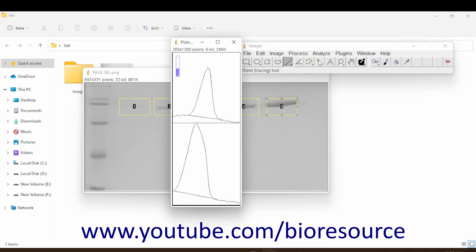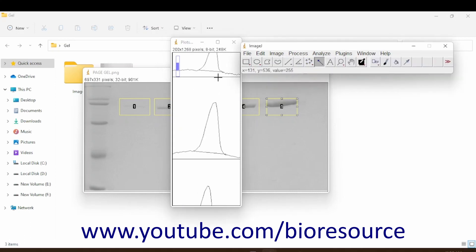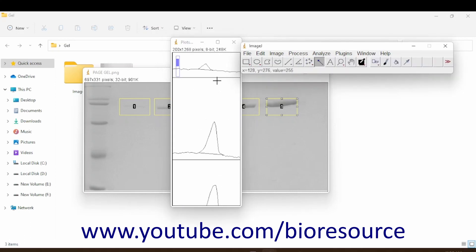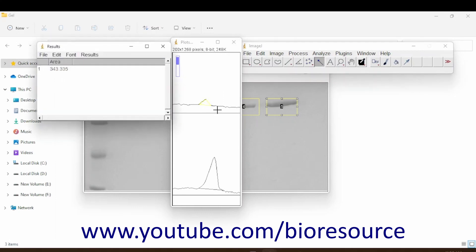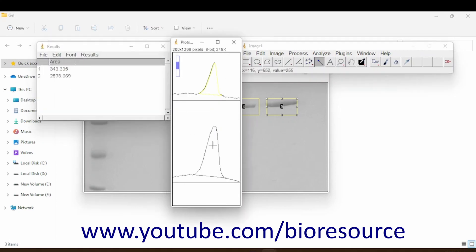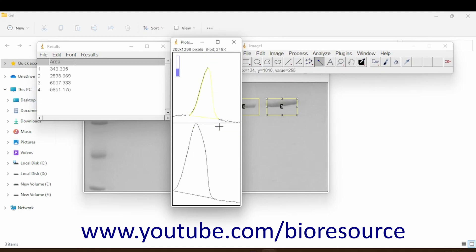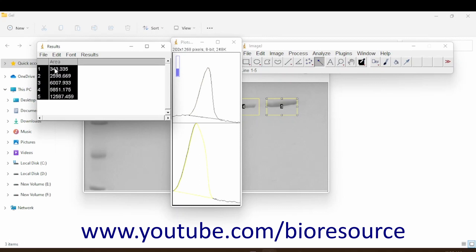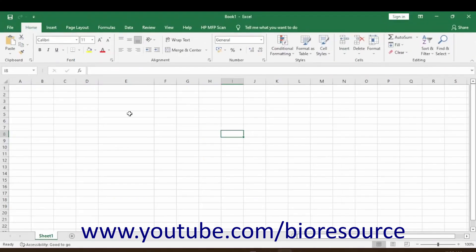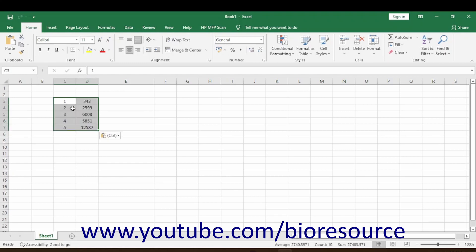Use the wand tool to mark the area under each peak. We have the first one, second one, third one, fourth one, and the fifth one. Now you can copy all of these values into an Excel sheet.